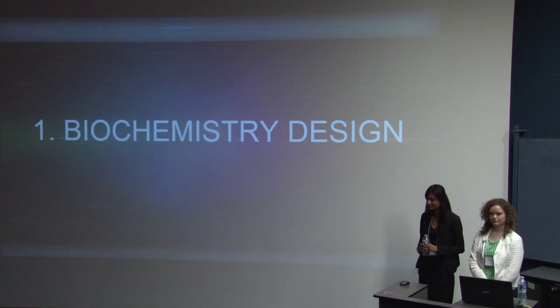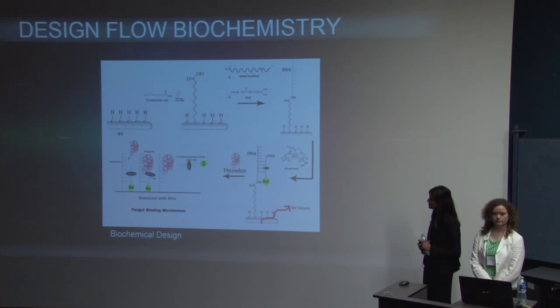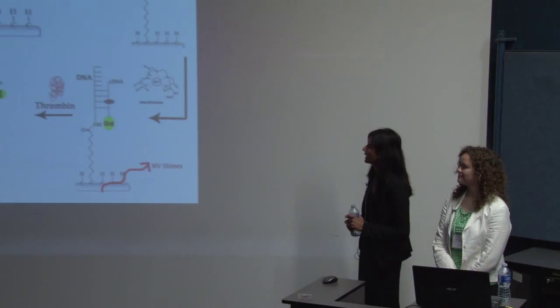So here we can see that through the design flow, we had a hydrogen terminated diamond which was doped with nitrogen vacancy centers, and through UV photo attachment and EDC reaction we were able to attach DNA aptamers to our diamond. Then we were able to incubate a complementary DNA which had a gadolinium molecule attached to it, so that we could have the gadolinium molecule close to our diamond.